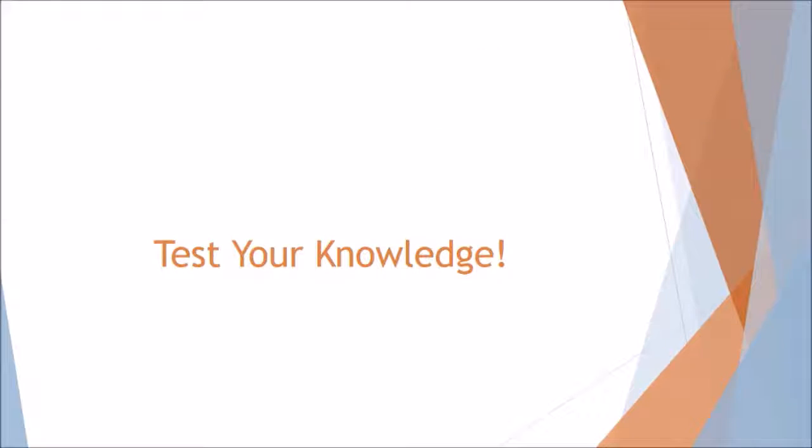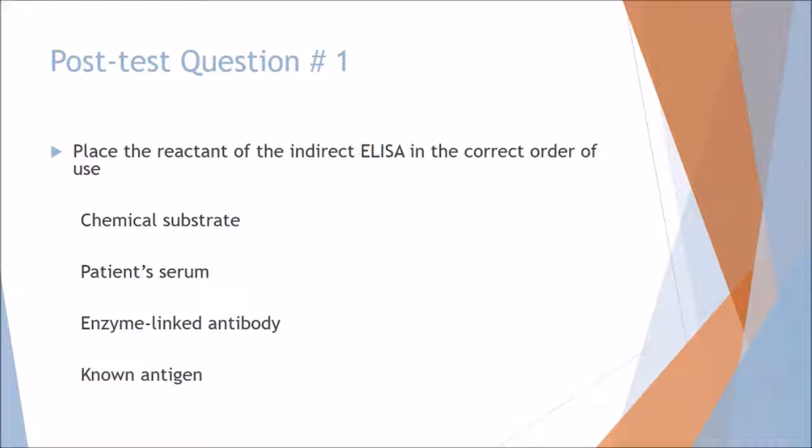So now I want to test your knowledge on what we've discussed through this presentation. We have a few questions. So in this first question, we want to place the reactants of the indirect ELISA in the correct order.